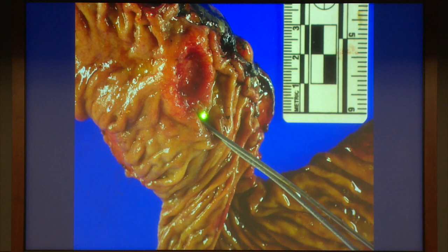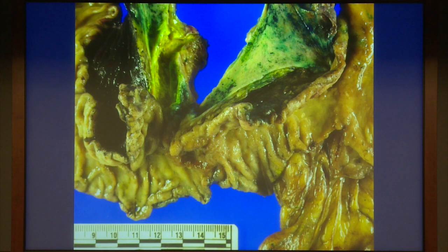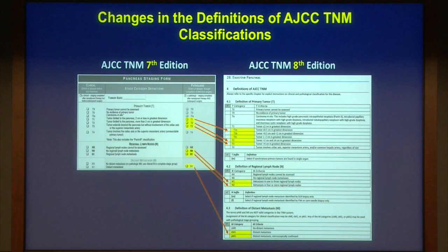Likewise, ampullary carcinomas are a little bit easier, except that sometimes as they grow, and now this is a fixed specimen in formalin, and the pancreas is going away from you into the wall. Here's the common bile duct, the pancreatic duct, and this sort of rolled edge is an adenocarcinoma that actually began in the ampulla, this almost invisible space, and rolled out onto the duodenum and a little ways into the pancreas. So we have to have our wits about us and do a little bit of work to sort that out.